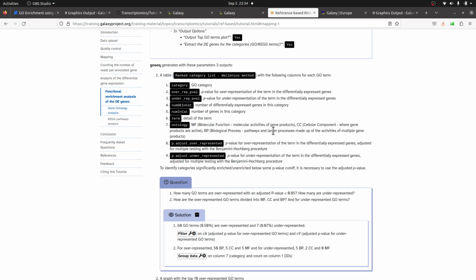Normally with the Galaxy platform, you have updates and stuff going on, so there are a number of factors. If they are different, you can investigate further to find out what happened, or you can also contact the Galaxy developers. But in general, it should be fine. And some of these tools are also a bit stochastic, so that will lead to a slight difference in what you have. But nevertheless, we have been able to reproduce this tutorial, so that's fine.